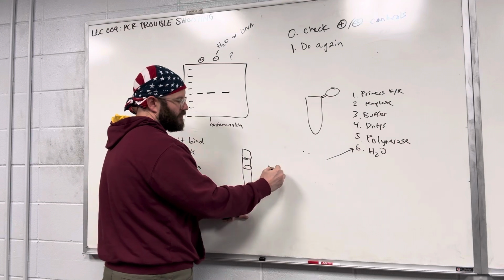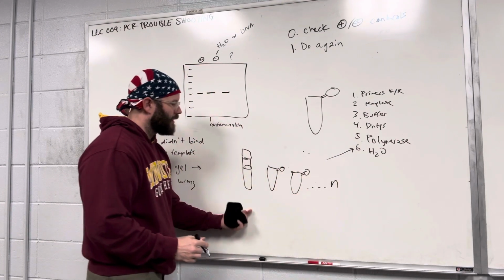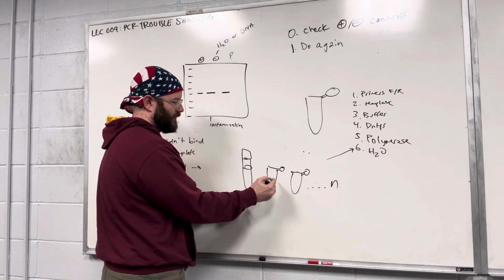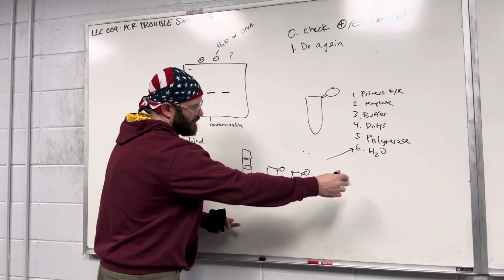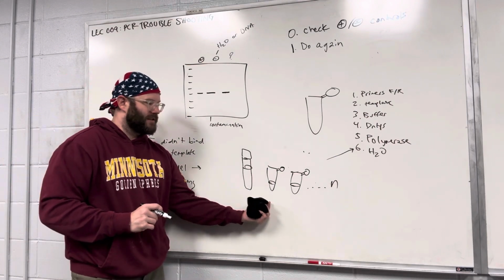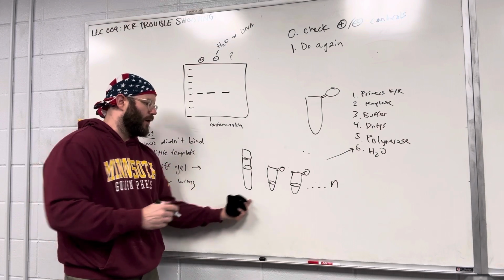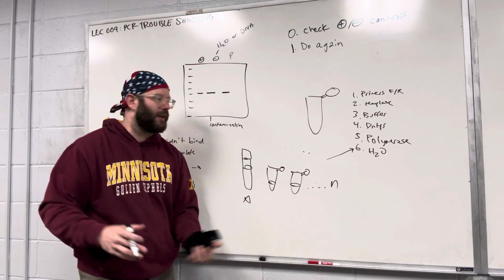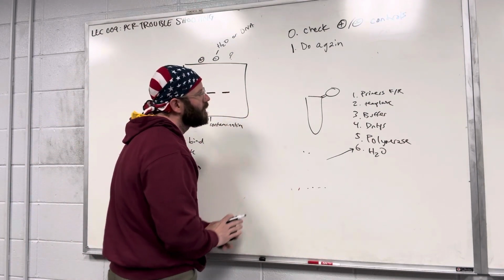As soon as you get it, you open it up, take out 50 microliters, and put 50 microliters in an aliquot tube, and repeat. Close these up and put them in the freezer. This is a tool to help prevent contamination. You never want to be drawing from the same source over and over amongst a whole lab of different people.